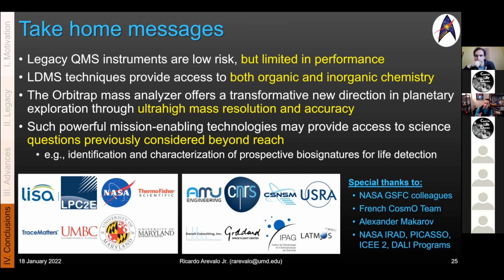So we thought, okay, we don't want the salts competing with the ion volume in the Orbitrap, so our organic mode will start at mass 75. The mass range of our instrument with our Protoflight electronics, which we're trying to reproduce what Thermo can do, but making it compatible with flight means you cut some corners. We can see about 30 to 40x. About 40x is our upper limit from the low mass range. So whatever your low mass is, multiply it times 40, and that's your upper mass limit before you start rolling off in performance.